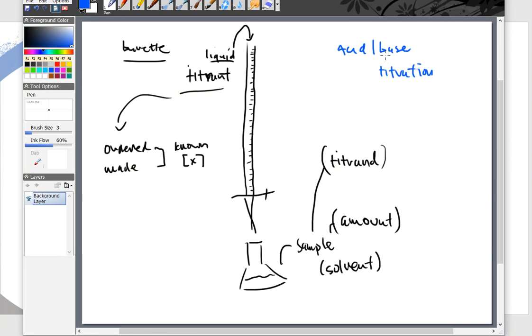But folks, there's tons of different ones, and that's the purpose of this grouping. We're going to get you to do titration after titration after titration, because we want you to understand that it's more than just an acid and a base sometimes, okay? But this is where we're going to start out. It's one of the most common, one of the most basic types of titrations out there, so it gives us a good starting point, but there is more to the world of titration than just acid-base.